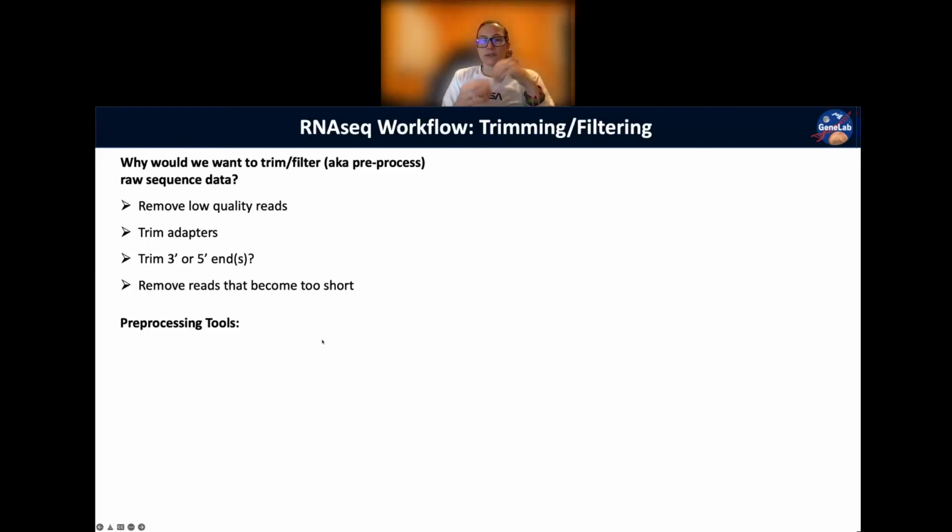And so there are several tools. Are singletons a problem? Would you remind me what singletons are, Susie?